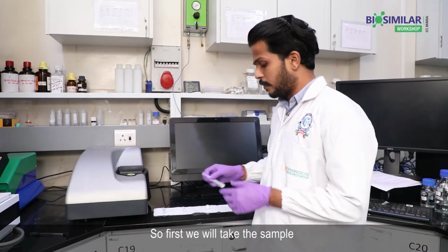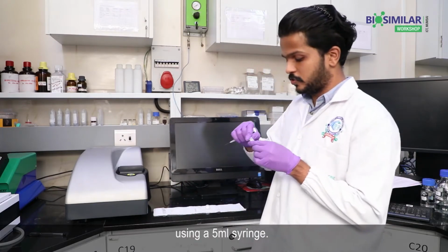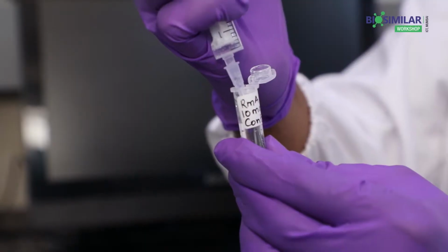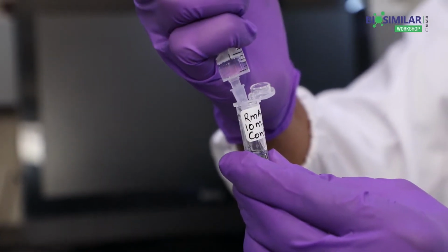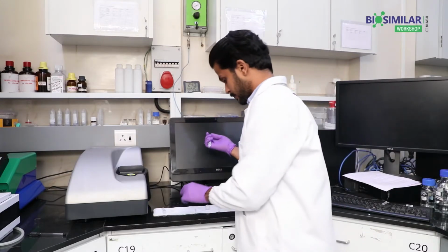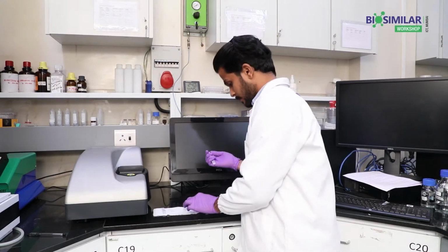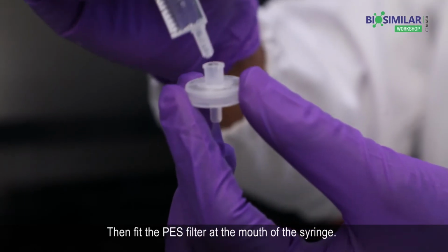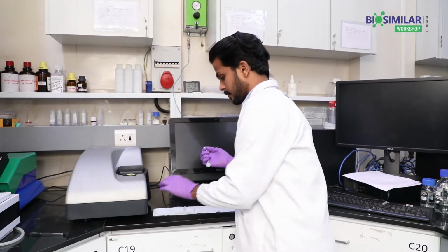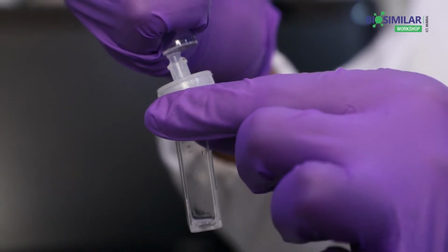So first we will take the sample using a 5 ml syringe. Then fit the PES filter at the mouth of the syringe and filter it through the filter into the cuvette.